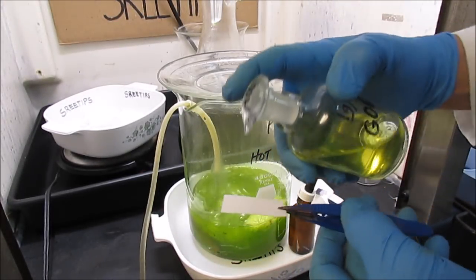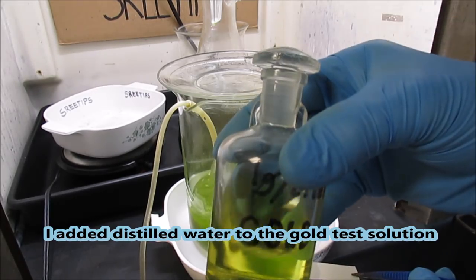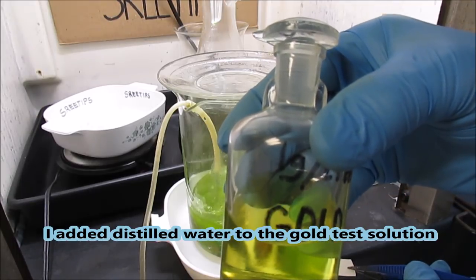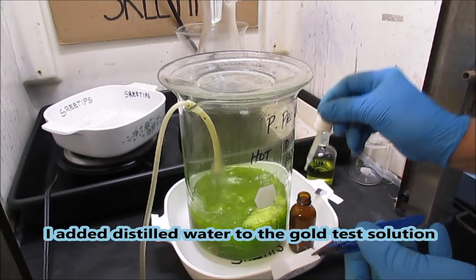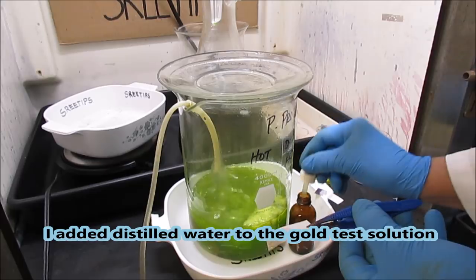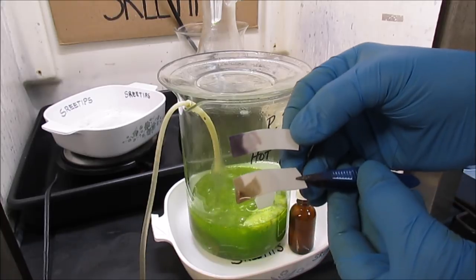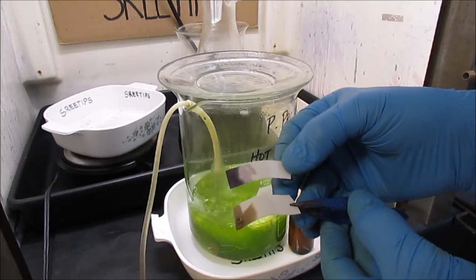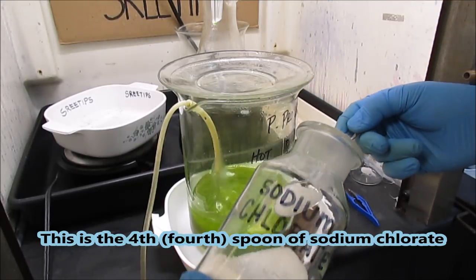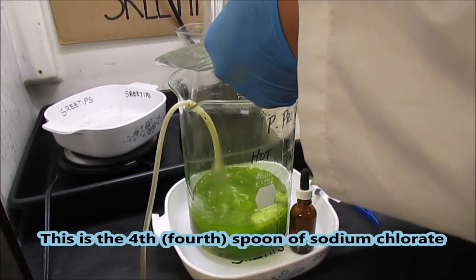As a comparison, I'm going to take a little bit of standard test solution, put on a piece of filter paper here. This is made by dissolving 1/10 of 1 gram in a little bit of aqua regia and then adding liquid to 100 ml. And put a drop of stannous on this. And that's what that looks like. Here's what our test out of the beaker looks like. And what we can do here is get a general idea of about how much gold we can expect in solution. I'm going to add one more spoon of sodium chlorate, and then we'll let this go ahead and bubble for a while and just come back and check on it here in an hour or so.